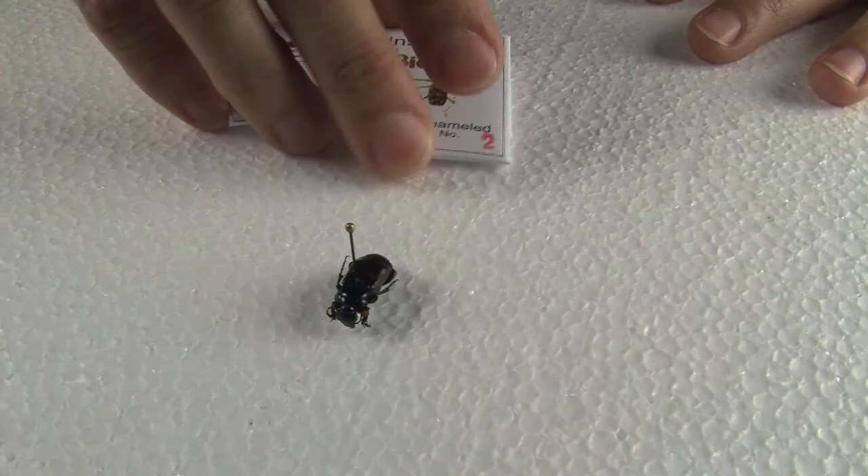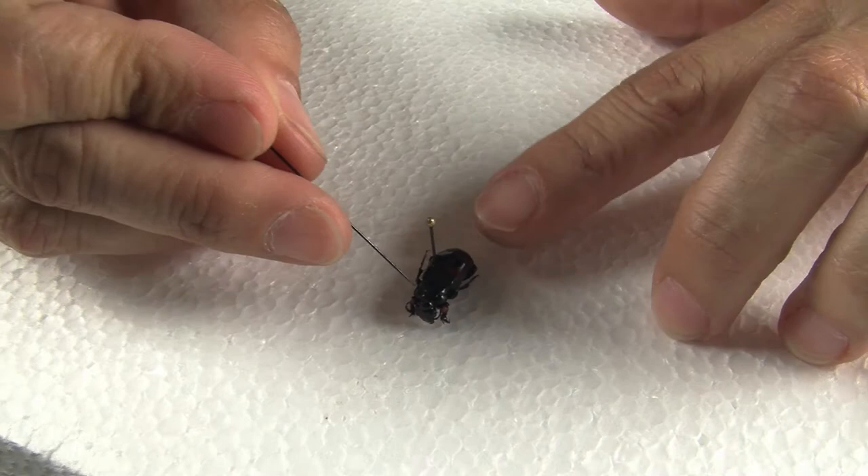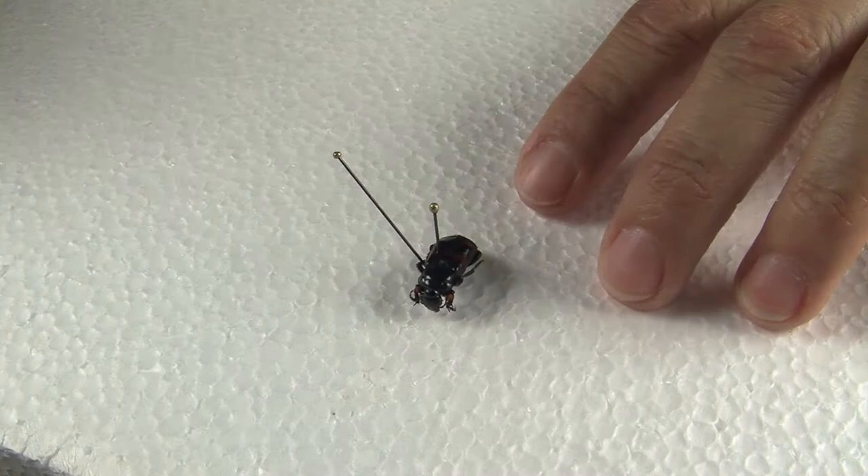After you pass the pin through the insect, put it back in your pinning board, push it down, and you want to make the insect look as nice as possible — meaning that you can stretch the legs in such a way that it looks like the insect is waiting to be caught.